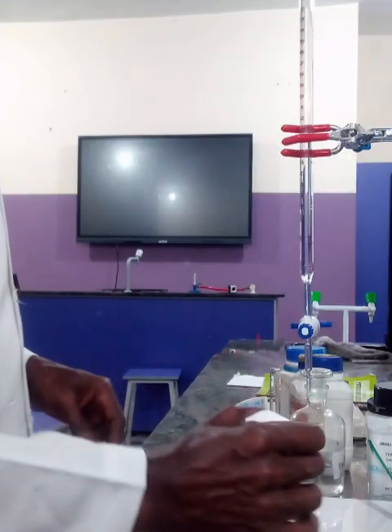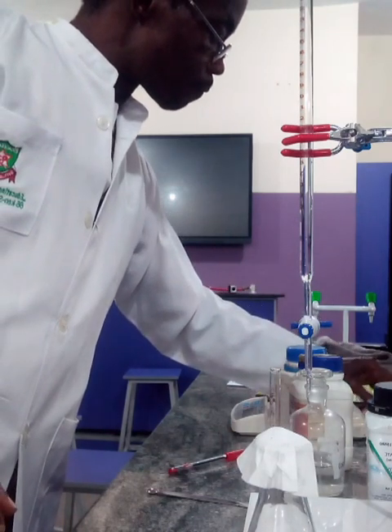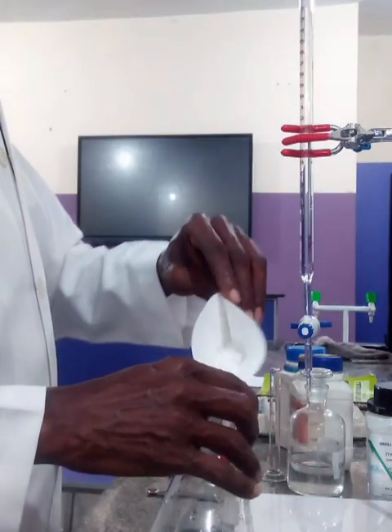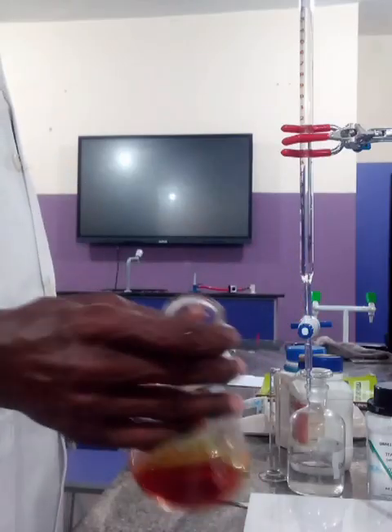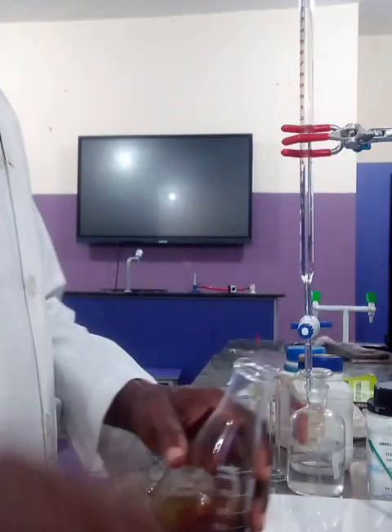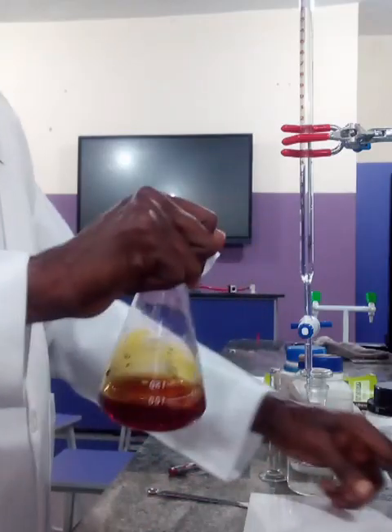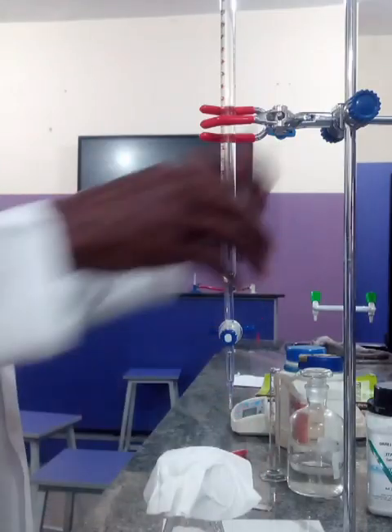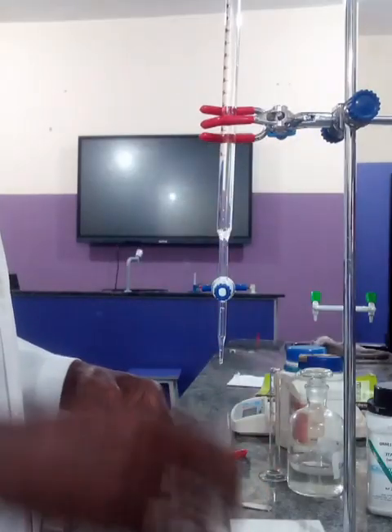After this first titration, you carry out 2 or more accurate titrations, and then you find your average titer. That is, you find the average volume of the sodium thiosulfate that is needed to react with a given volume of the bleach.